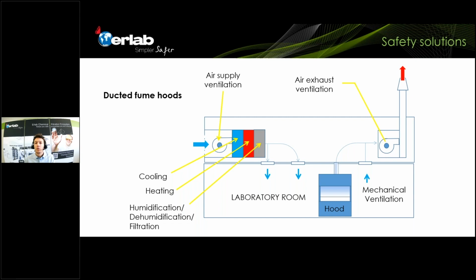So a ducted fume hood is a good solution. It will keep you safe. It's an important safety equipment that can be used, but it depends again on the risk that you're exposed to, and you need to know what to use.